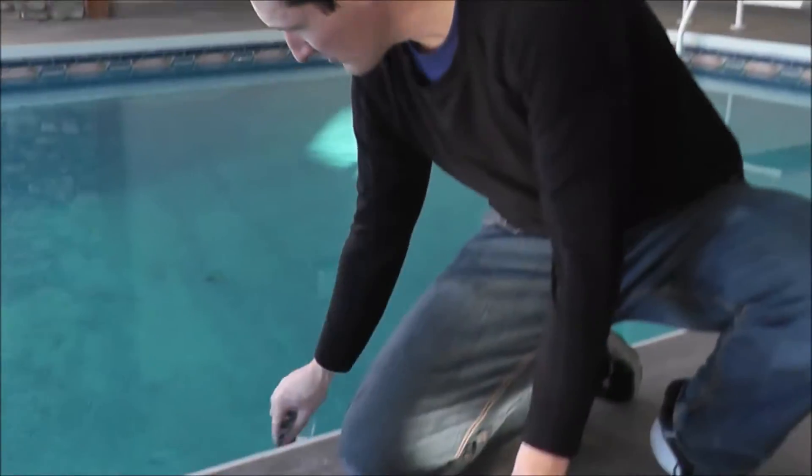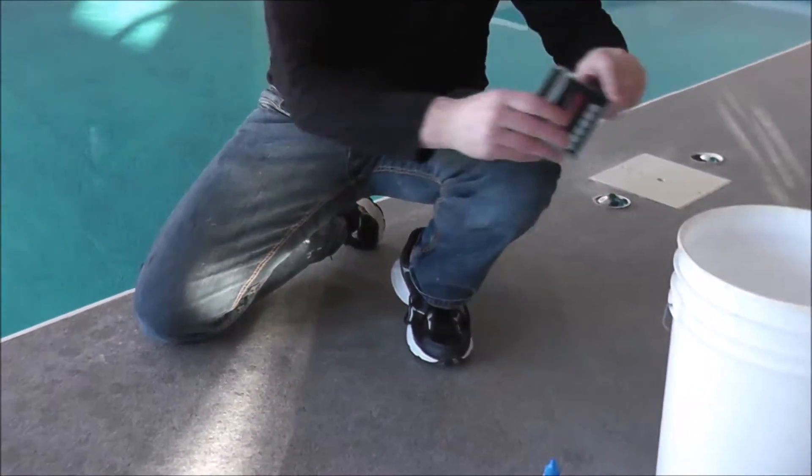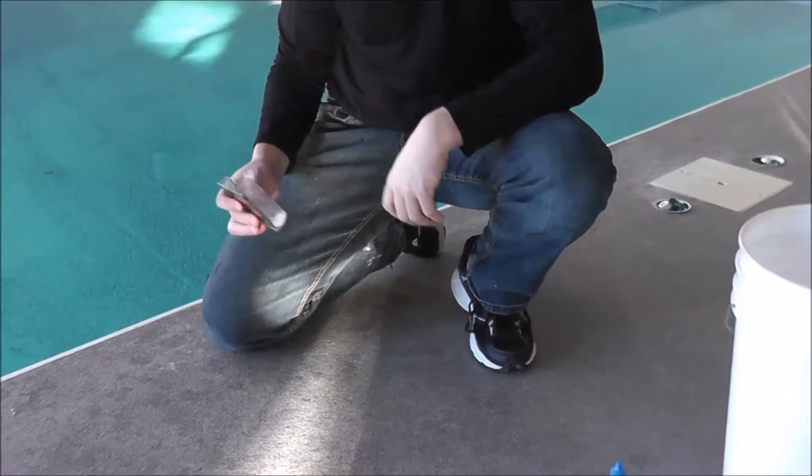The first thing we do when we test is make sure the tester is clean. Take some water, shake it up, and always dump it outside the pool — you don't want to get any reagents inside the pool.